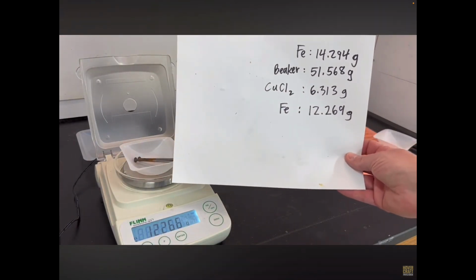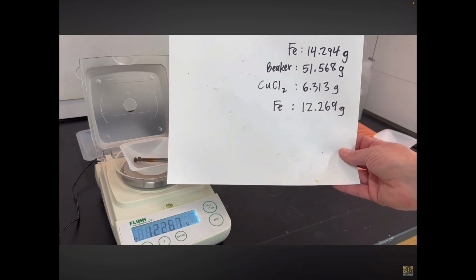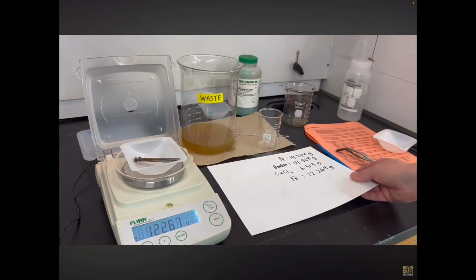Yesterday, the mass of the nails to start was 14.294 grams. It has decreased because some of that has been converted into the iron chloride product. So we can check that value, the 12.269 grams, against our BCA chart and stoichiometric calculations and see how close we are to the prediction.